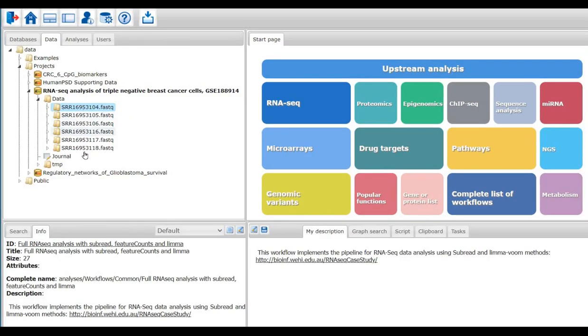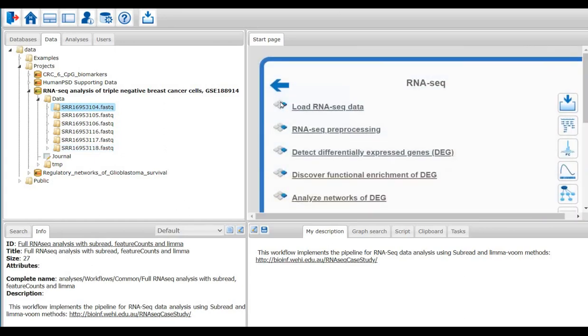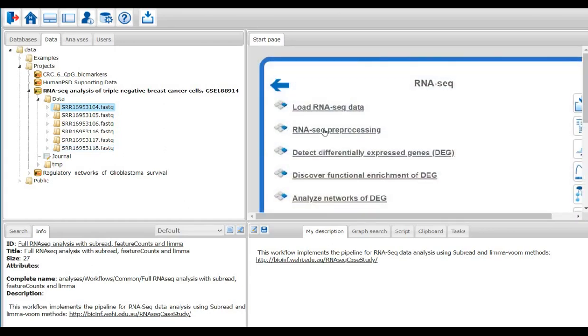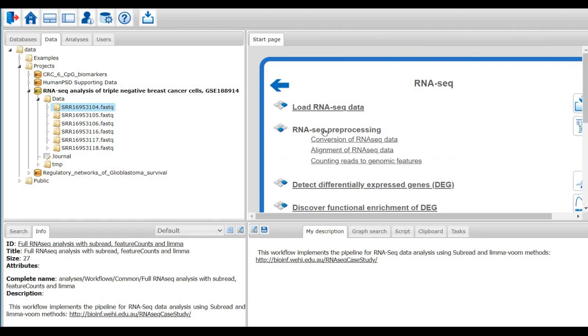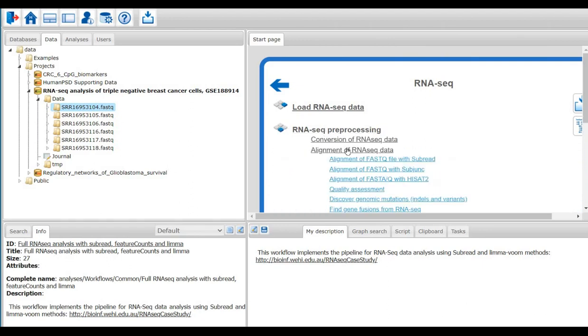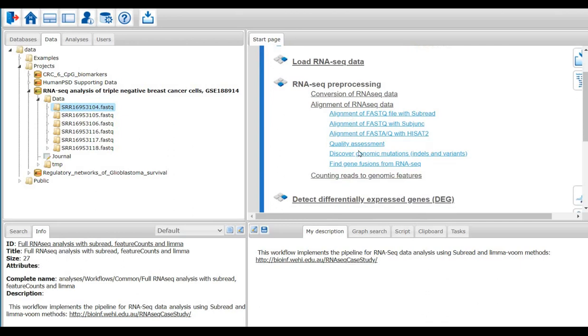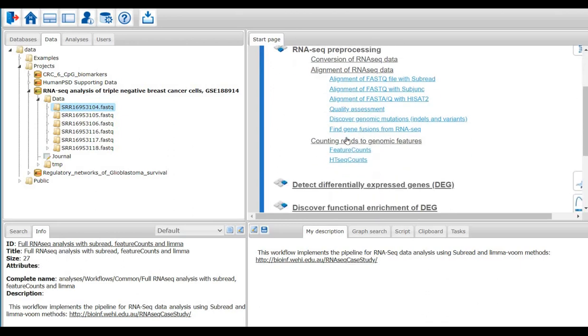Now my FASTAQ files are ready to be analyzed. I open the home page of the platform and go to the RNA-seq button. Under RNA-seq pre-processing, there are methods to map FASTAQ files to the genome. Also, there are methods to count the reads.